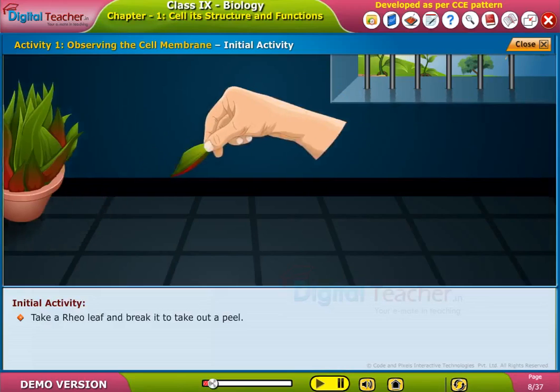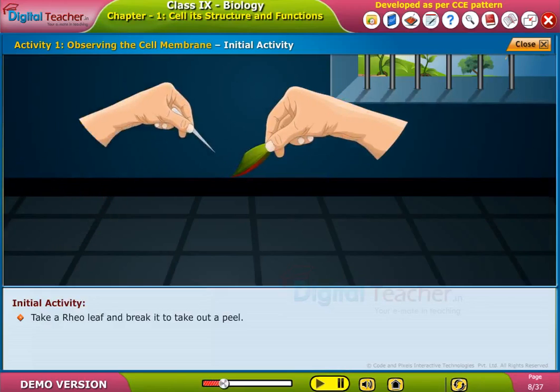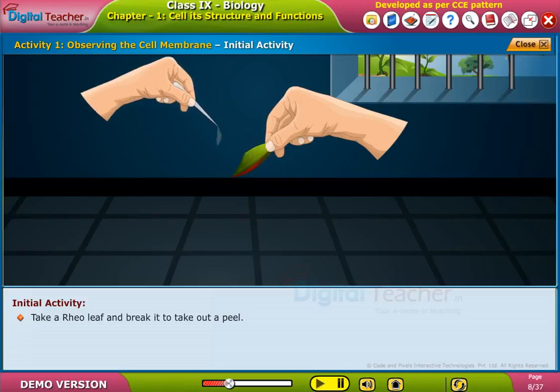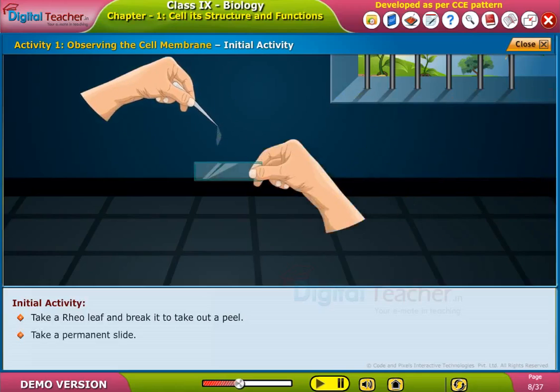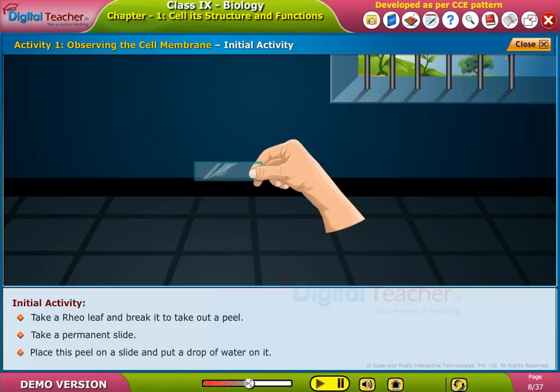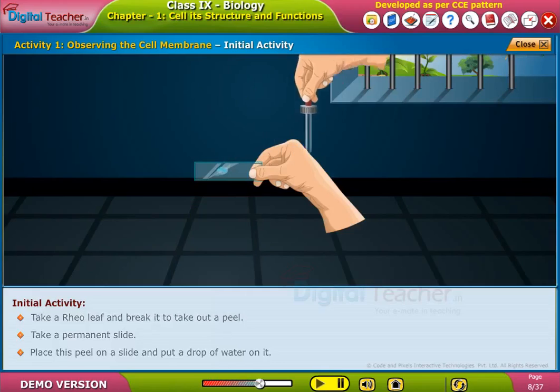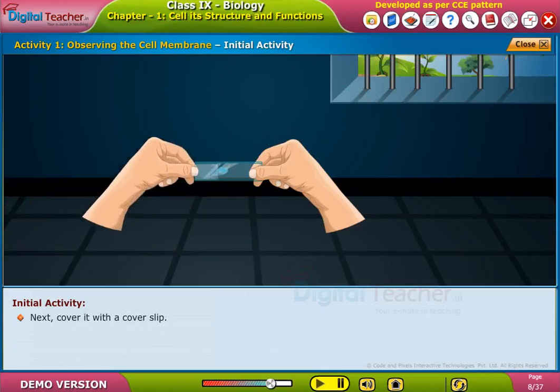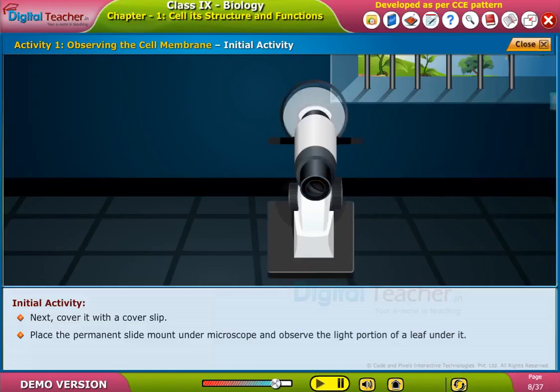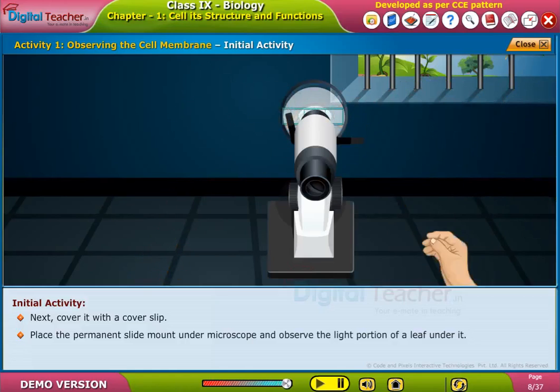Take a Rhoeo leaf and break it to take out a peel. Take a permanent slide and place this peel on the slide, then put a drop of water on it. Cover it with a cover slip.